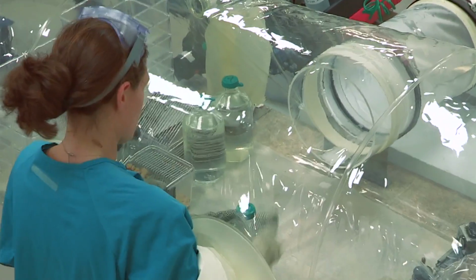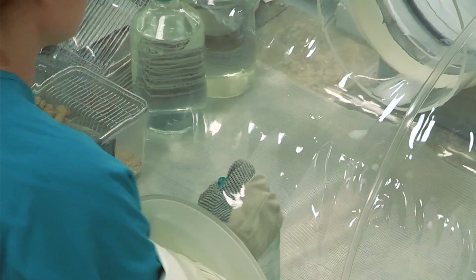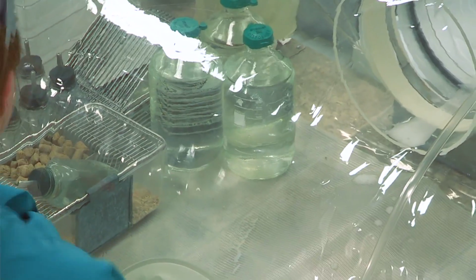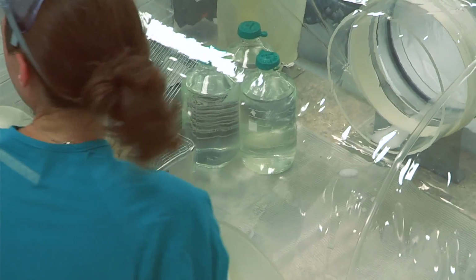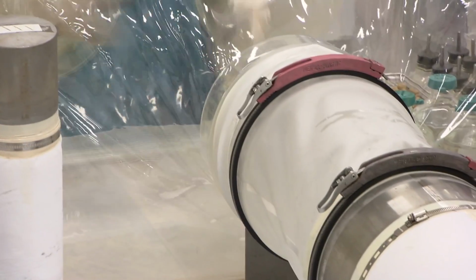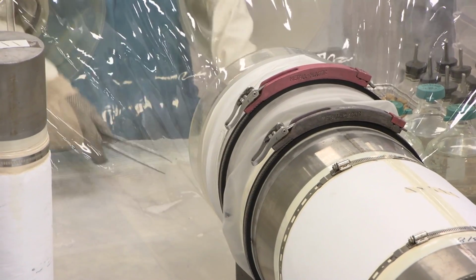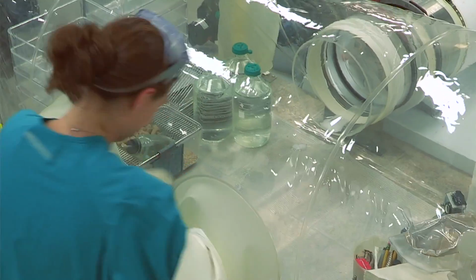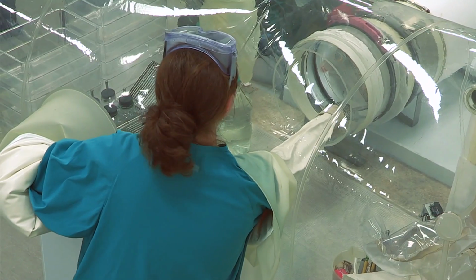And at this time, if you want to go ahead and pop the seal on your water bottle just to release the pressure, that helps. So now I need a volunteer to move this cylinder up towards me. So the whole thing just gets, just push it right up. Yes, thank you. So this can be done alone, but it's not recommended because it's very difficult. So once it's moved up, go ahead and reach in and pop the mylar.